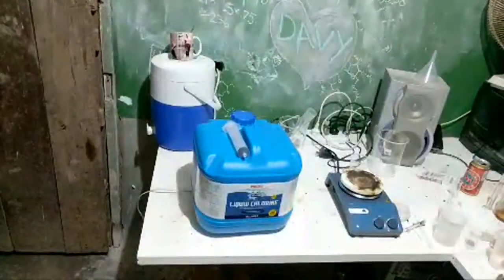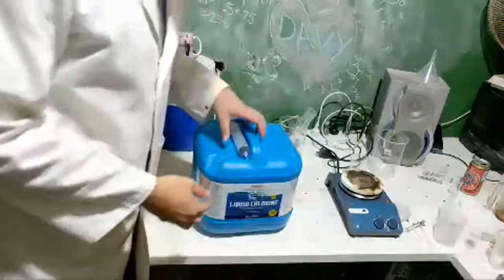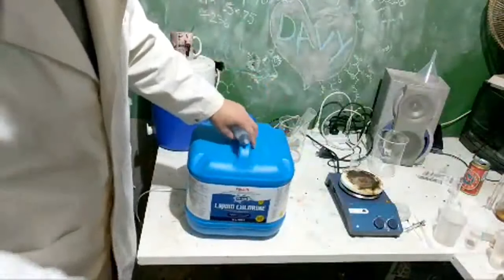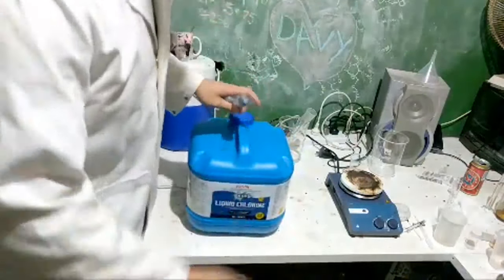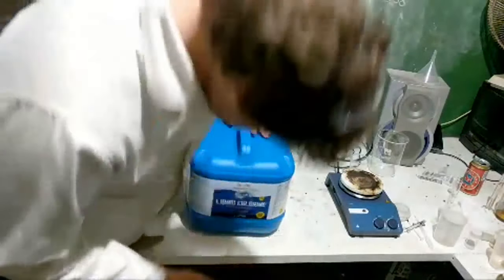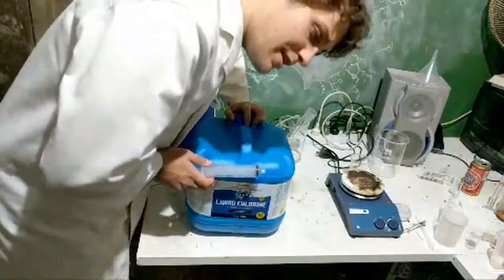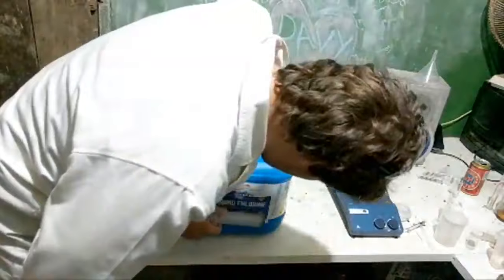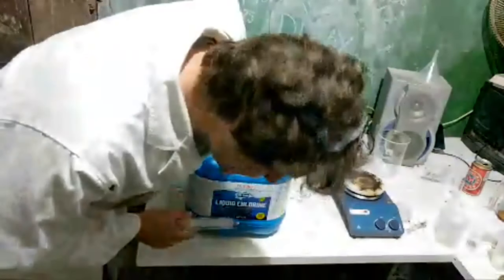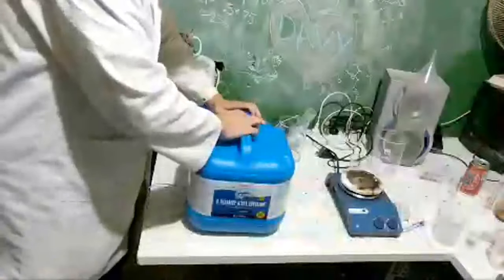So usually when a chemist says liquid chlorine, they mean liquid chlorine, but this is hypochlorite bleach. Mosquitoes could have, I've got to kill as many as I can tonight, there's quite a lot of them. When this was sold to me, it was 12.5% hypochlorite. That was probably about a year ago, so it's probably a lot less than 12.5%. I can't even get the lid open.